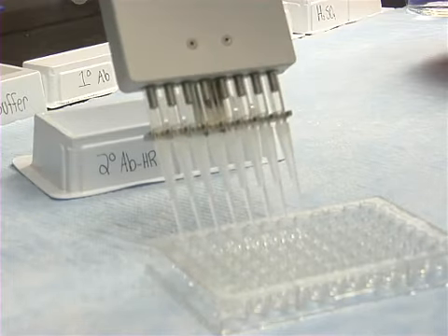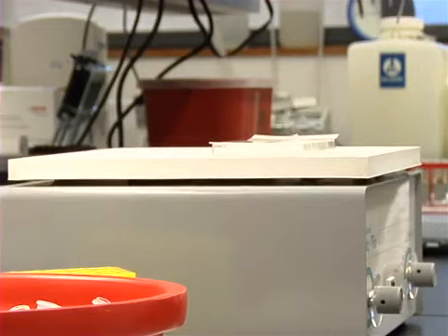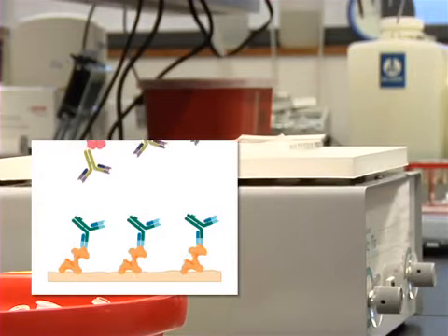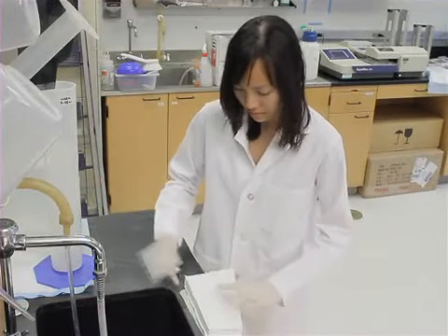Secondary antibody is then added to the plate, and the plate is once again incubated, typically on a rotating platform, to allow secondary antibody to bind. Washing steps are repeated as before.